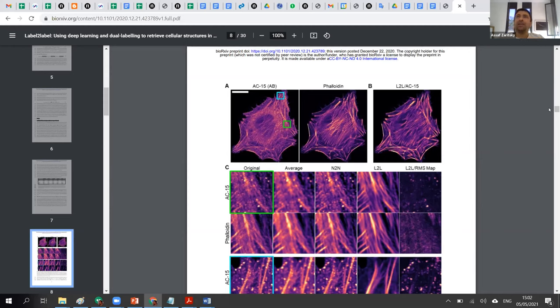So they say, okay, you have different staining for different organelles or molecules, right? For different proteins, you can use different fluorescent markers, and each marker is better at one thing and worse at other things. Every time you mark yourself with fluorescent markers, you want them to be as specific as possible to what you want to image, right? But still, the specificity is not perfect. You also get some other fluorescence that is not specific to the objects that you want to image.